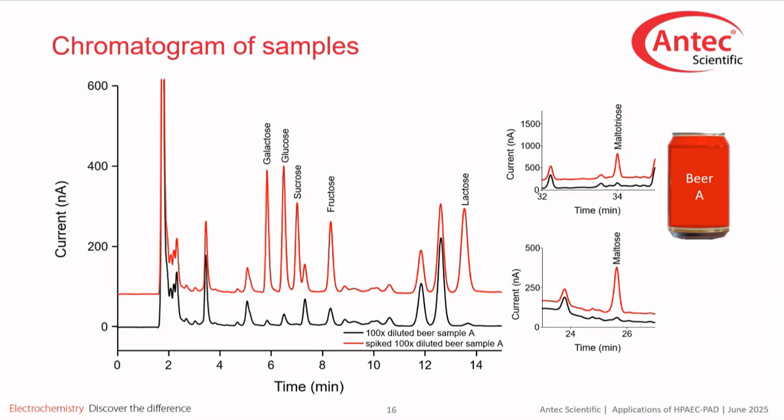In all alcoholic beers, maltotriose emerged as the predominant sugar, concentration-wise, with fructose coming next. Please note the time region between 1.5 and 3 minutes, where several peaks elute, and the first one is likely ethanol. These peaks are characteristic for alcoholic beers and are absent in non-alcoholic variants, which we will explore next.